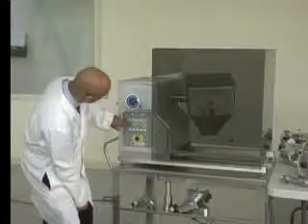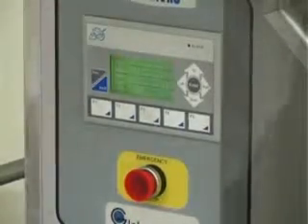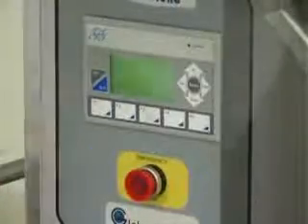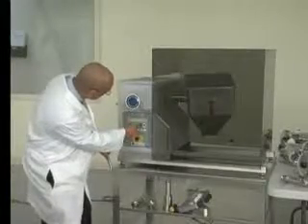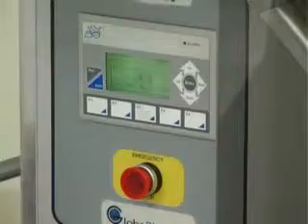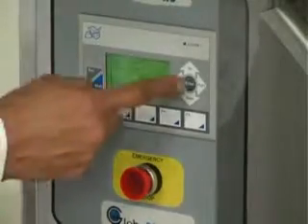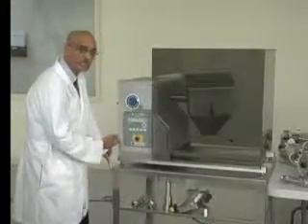If you want to set the shell time, press F1 which is here, and then you can scroll the time up or down by using the scroll buttons. It is right now set for five minutes, so we press enter. The shell time is now set for five minutes.